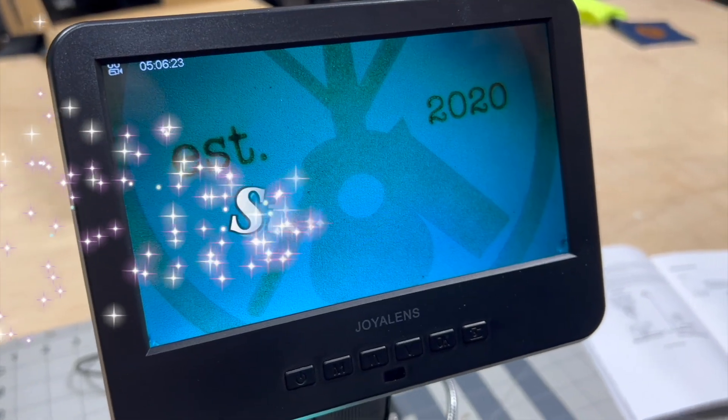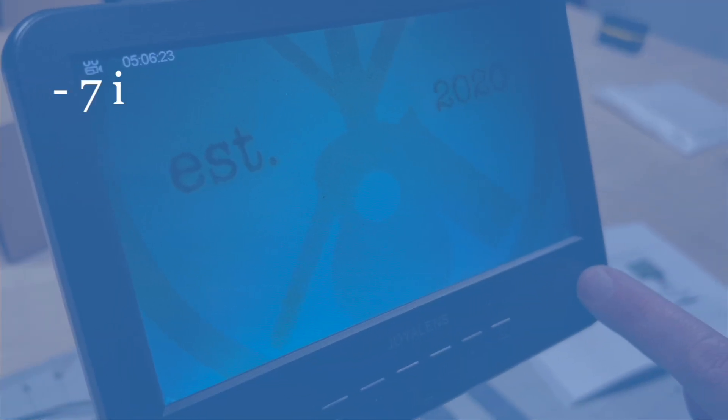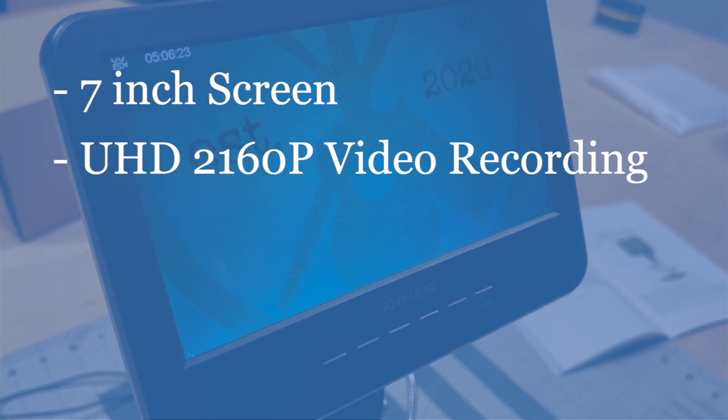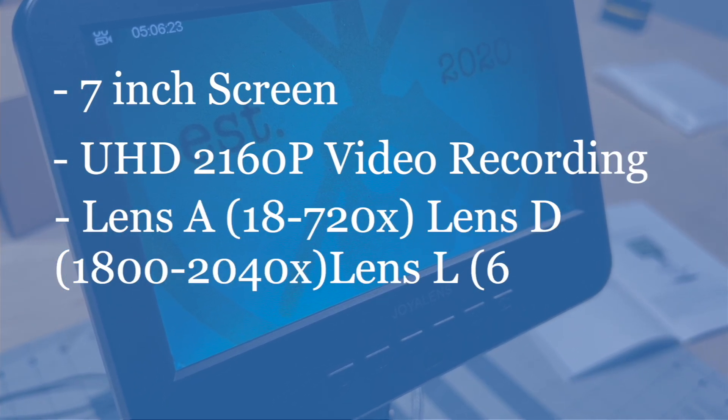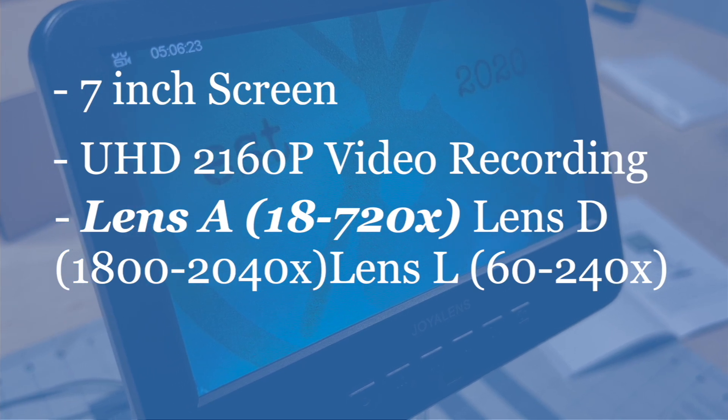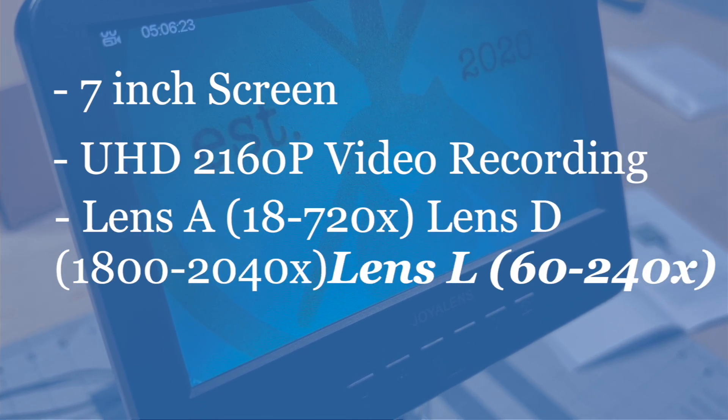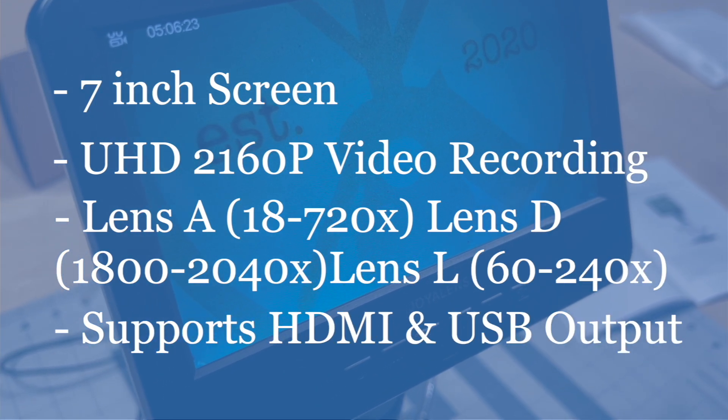So let's talk some statistics of this particular digital microscope. So you get a 7 inch color screen, this is ultra HD so it's 2160p resolution. You get three lenses. Again, one is 18 to 720 times, one is 1800 to 2040, and one is 60 to 240. Again, you can export the video out to a computer.